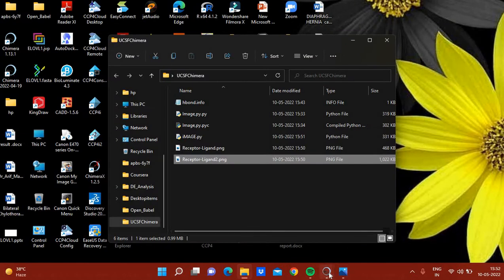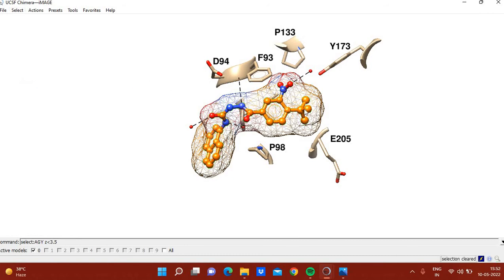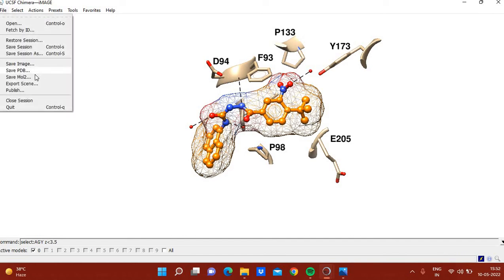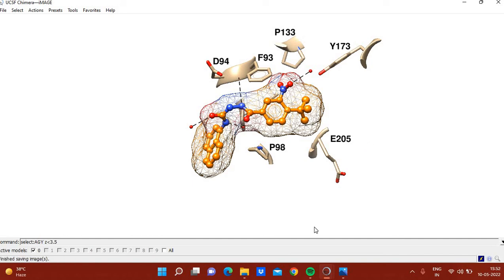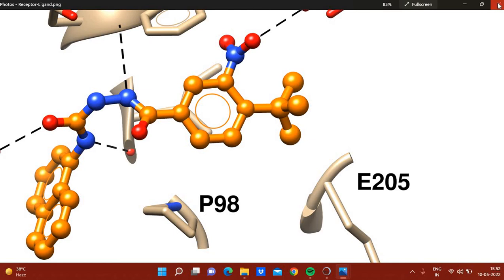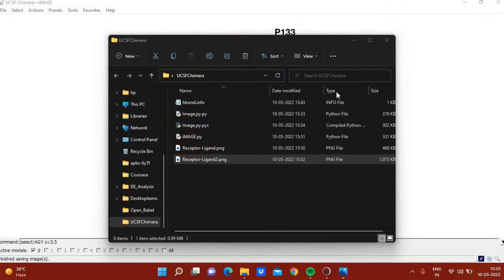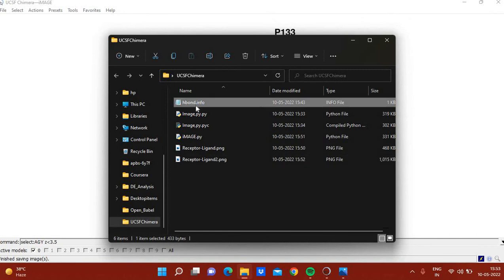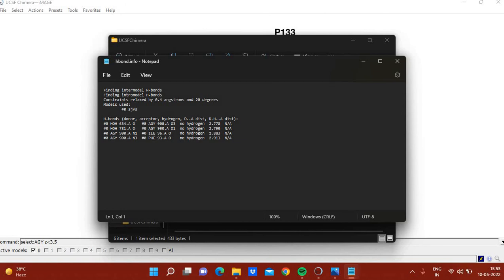Remember to click Clear Selection before saving the final image, because selected atoms appear highlighted in green. In the hbond.info file you can see information related to all hydrogen bonds — in this example there are four hydrogen bonds: two with water molecules and two with the receptor.